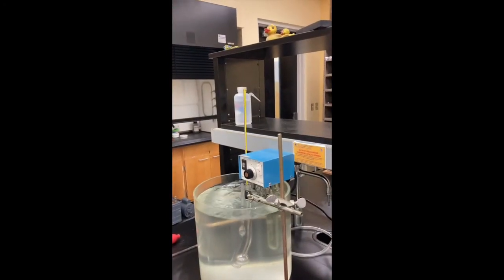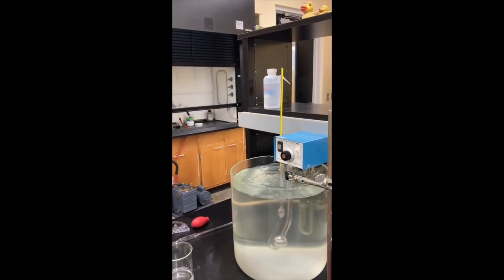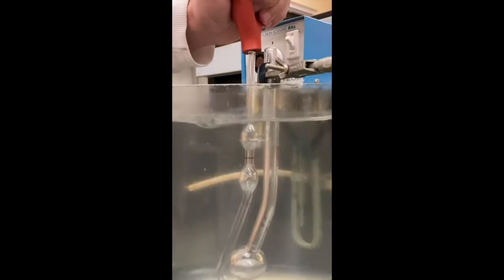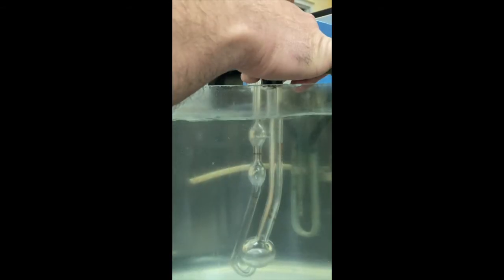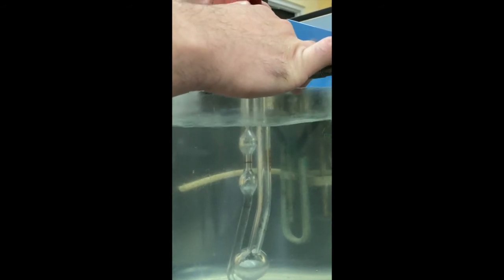Now we have 10 milliliters of water inside this viscosimeter, and we need to suction it above the upper mark. Yeah, now we are trying to suck the water so that it flows above.